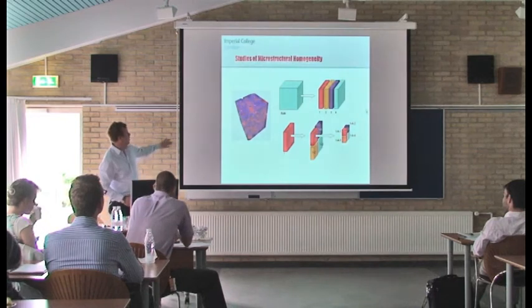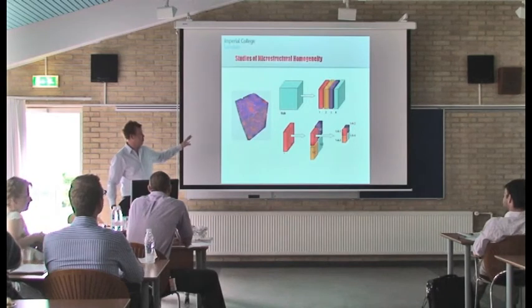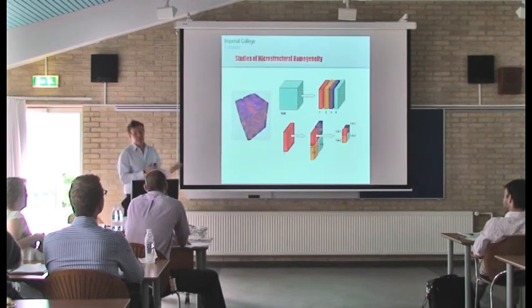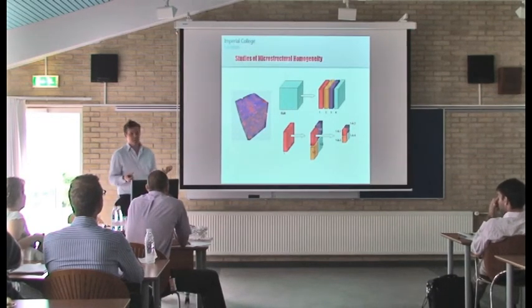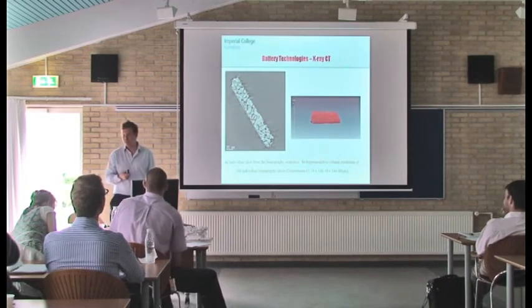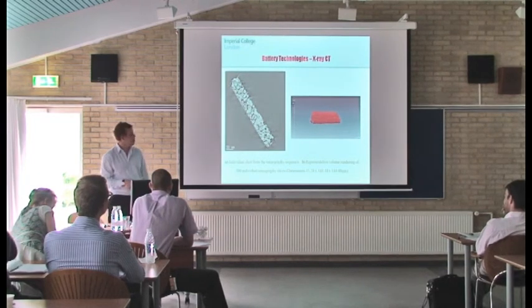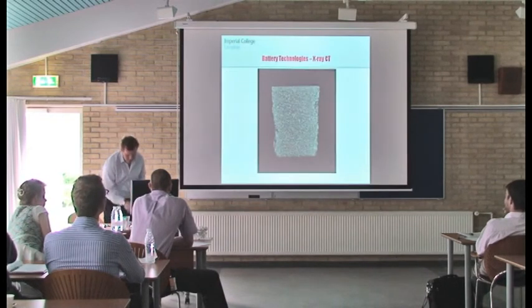And obviously, once we've reconstructed the data, we can then use this for studies of microstructural homogeneity. In a recent paper, we took a bulk electrode and split it up into lots of different pieces. And obviously the smaller the sample is, you move away from microstructural homogeneity and you discover heterogeneity, which just emphasises the importance of characterising a sufficient sample. And also, as James mentioned, there's increasing interest in these tomography platforms for lithium-ion batteries, and we recently published some work on X-ray characterisation of graphite electrode, along with Peter Jorgensen, and did some of the nice geometrical analysis.